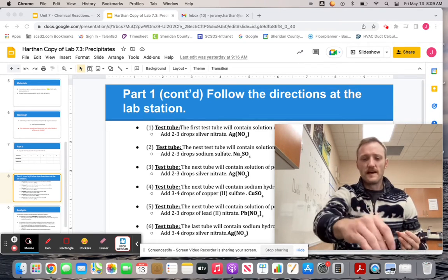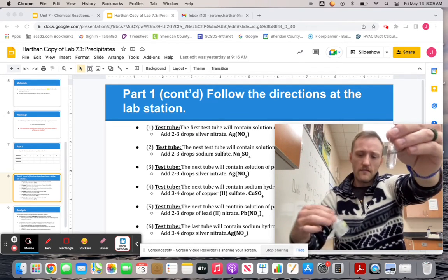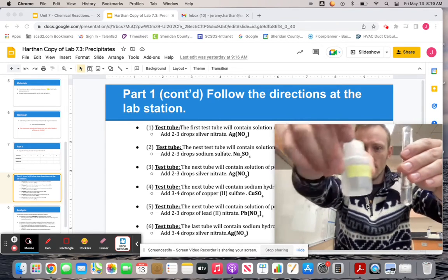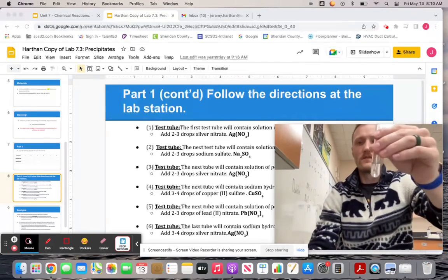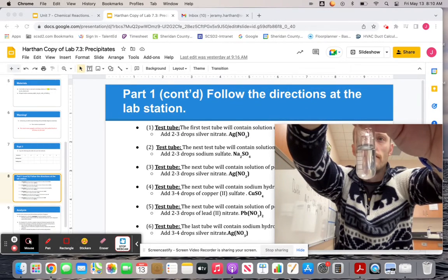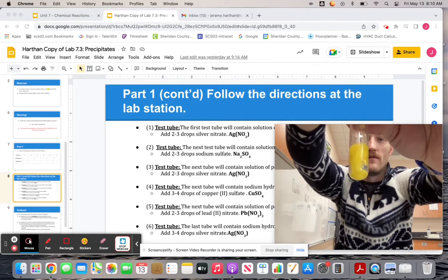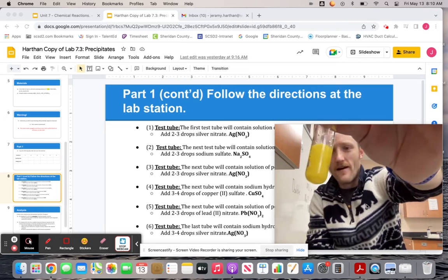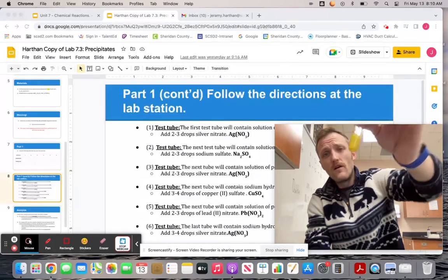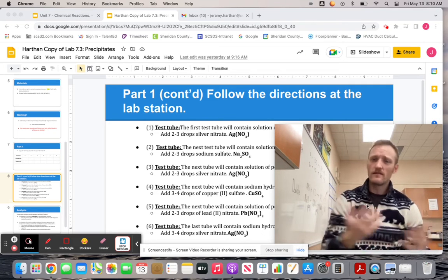Okay, all right, now this one. Okay, so we have potassium iodide. So this should be station 5. Okay, so again, nice clear liquid. And then we got some lead nitrate. Okay, another clear liquid. So this one, let's see here. Whoa. Okay. Wow. Right. So that one, I don't know if you guys can see, but if you look really close at it, we form this kind of almost chalky looking yellow solid, right? So again, another precipitate formed.